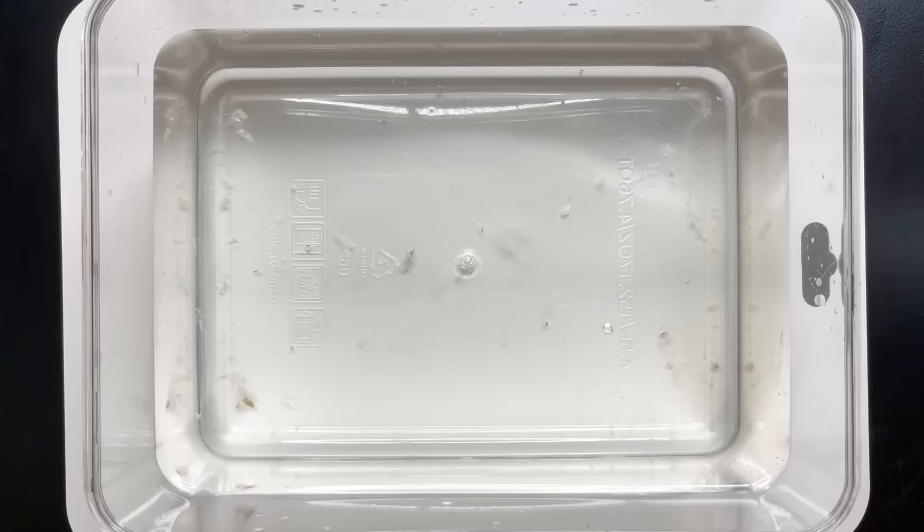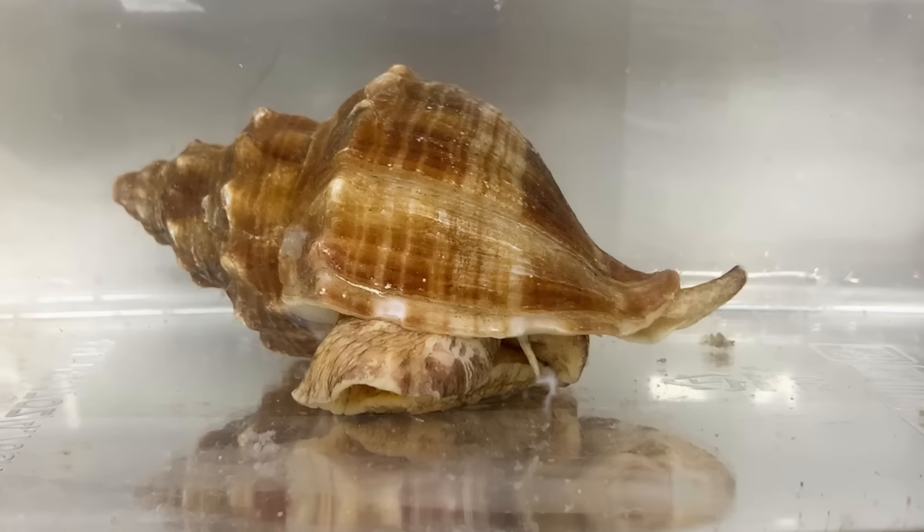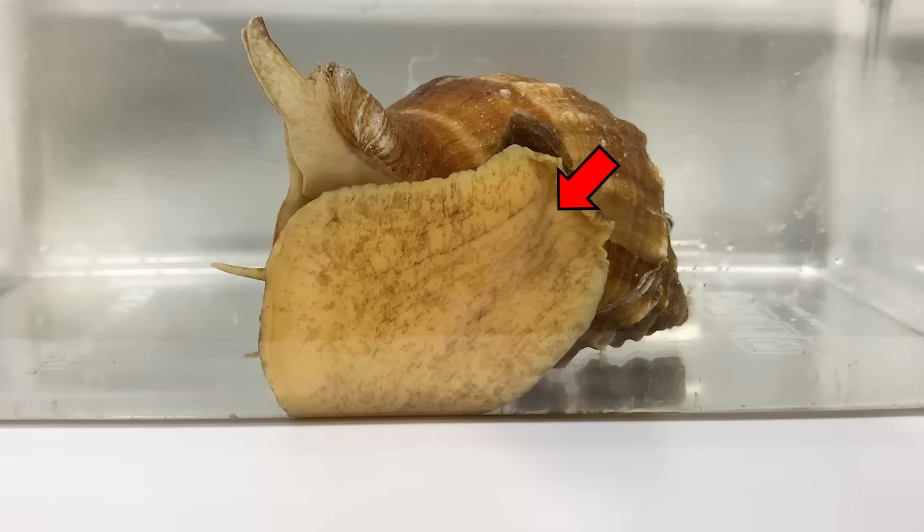Let's observe the whelk. It uses an operculum to seal the opening of its shell for protection. When gently placed in water, the operculum opens, revealing its tentacles and eyes extending outside the shell. It moves like a snail, crawling on the surface.